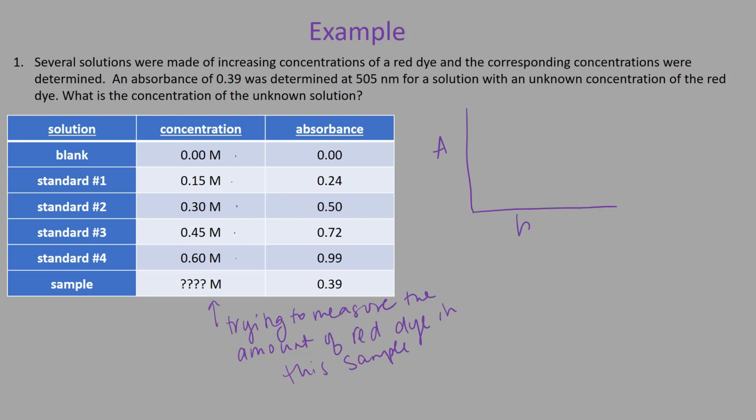So I'm going to graph absorbance versus concentration. I just stick these into the spectrophotometer and measure the absorbances of these, right? So I found my wavelength max to be 505 nanometers, obviously somewhere along the way. And then I measure all of these at that wavelength. So I made this sample, measured it, made this sample, measured it, made this sample, measured it, made this sample, and measured it. And now I can graph them all. Right? So I'm going to go ahead and do that.